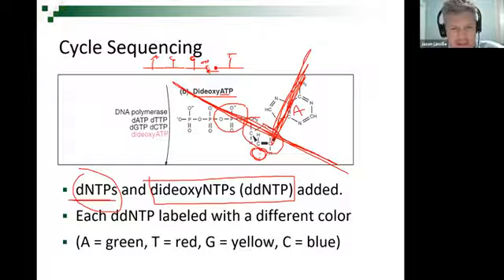So on regular dNTPs, we can snap those pieces together. Snap, snap, snap, because they have the little hook, the receptor on the 3' end, so we can add letters. The way I want you to think about the dideoxy ATPs is that it has this cut off. So it is not a little C at the end there. It just sort of ends with nothing on it. So when some new letter comes in to get added, it can't be attached to the ddNTP.